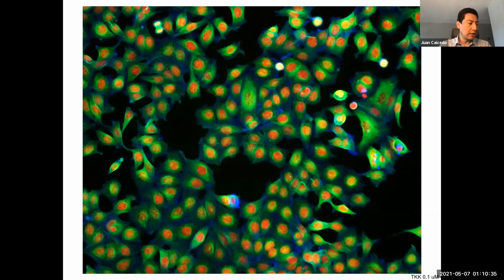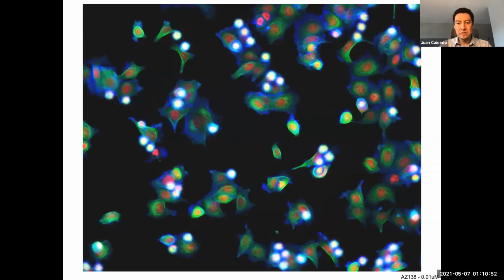In the previous case, we looked at one specific feature that you can use for determining cells that are sick versus healthy. But in the more general case, if we want to compare one population of cells like this one against another population of cells such as this one, there is no obvious feature that we can point at.